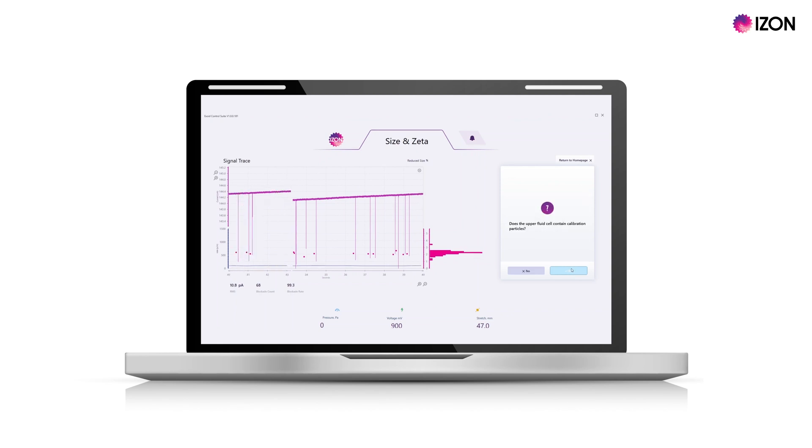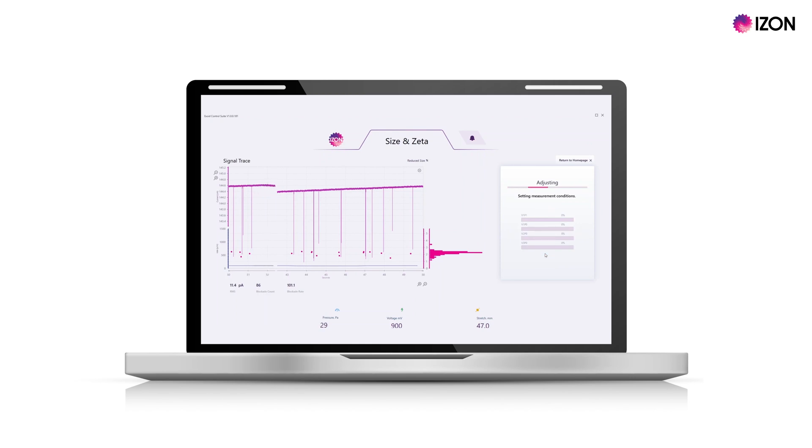With your calibration particles loaded, alter the stretch and voltage of the system so that you achieve a baseline current of approximately 140 nanoamps with blockade sizes of at least 0.3 nanoamps. Then hit start analysis.